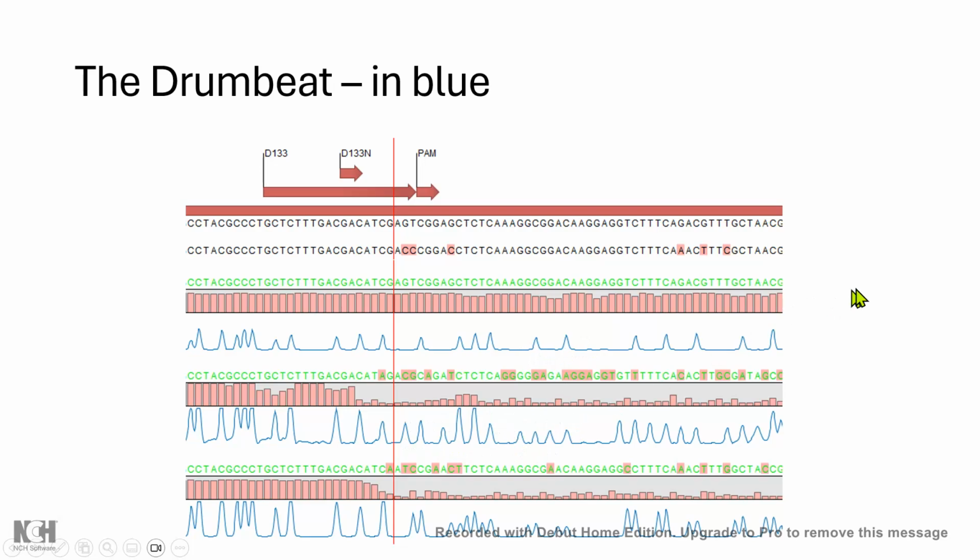You get the idea. So this is an easy way to basically diagnose a heterozygote even before you get them to homozygosity. So in our lucky case, this gene was actually survivable if you're knocked out. This isn't always the case. In fact, all too often it isn't the case. But this is a way of being sure of what on earth you're dealing with.